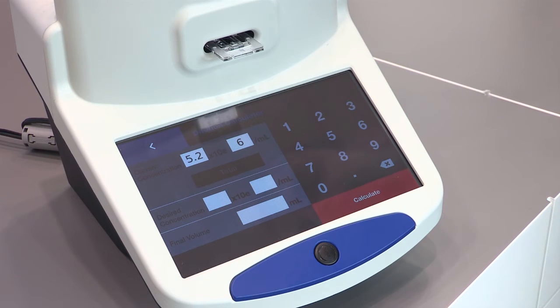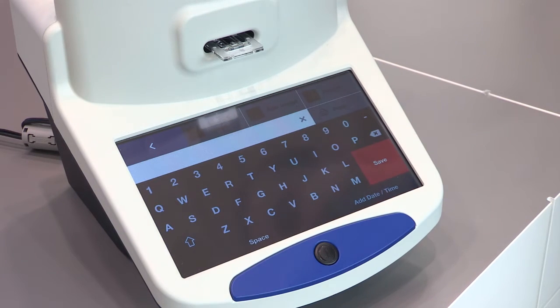Very nicely, it gives you a pocket calculator which helps you to get the right dilution factor for a target concentration. I can save this result either on a USB drive for later analysis — the USB drive information will give me a PDF.